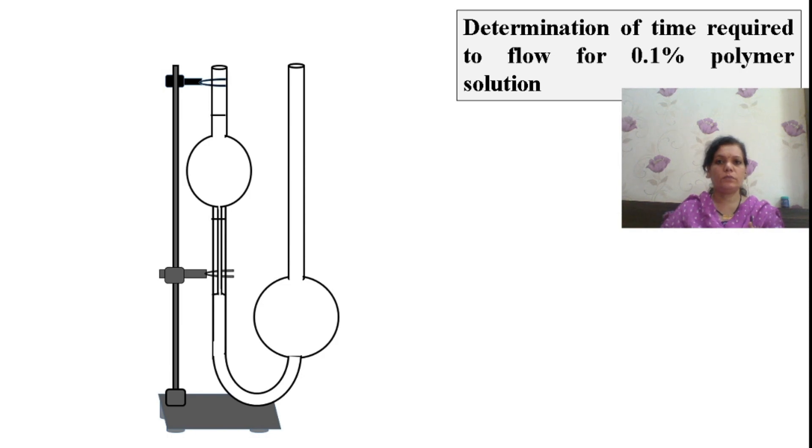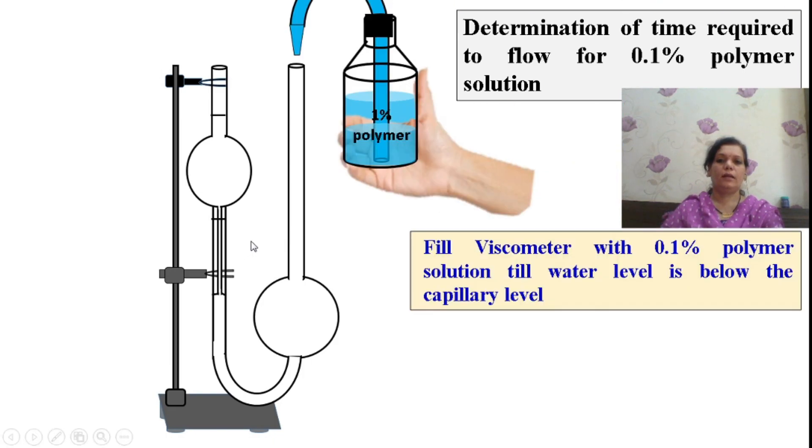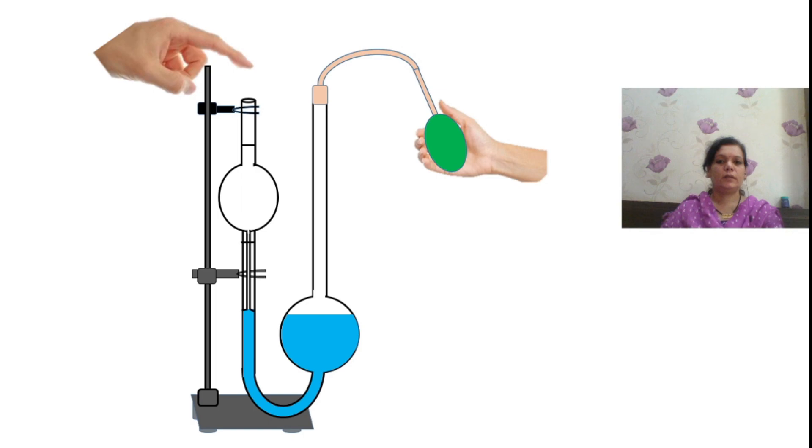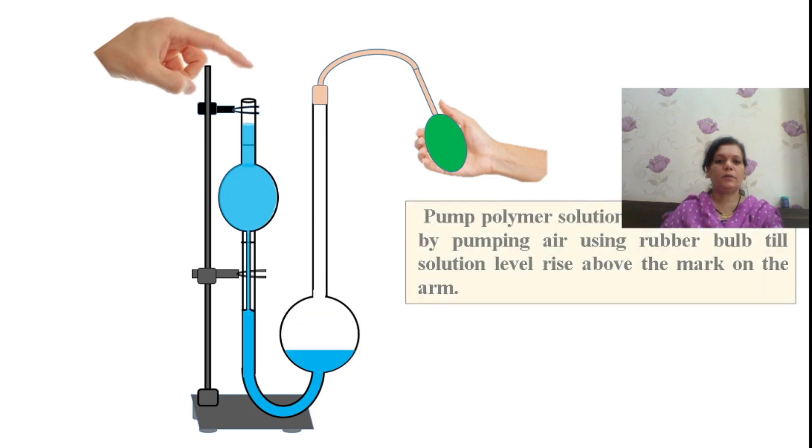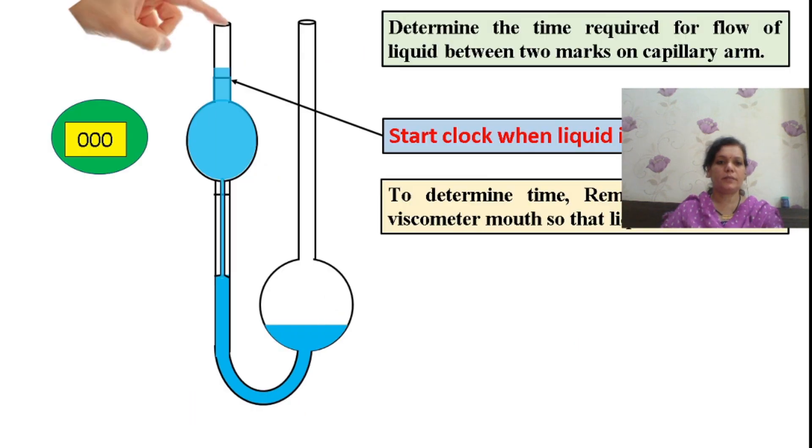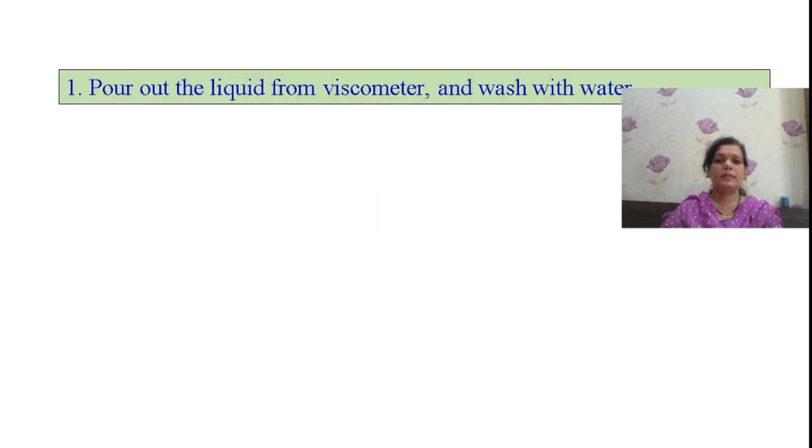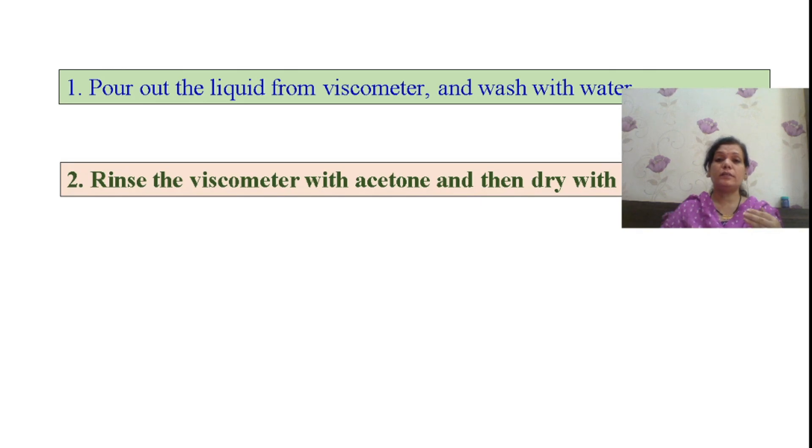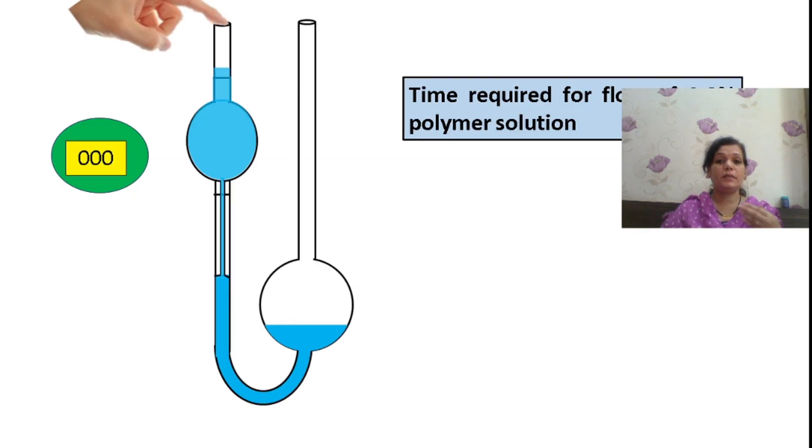Now, take your 0.1% solution. We will move from 0.1% to higher concentration. Fill it on this particular side. Look at the water level. Utilize the rubber bulb to pump air and measure the time of flow for 0.1% solution. It is 52. It is increasing. As you have utilized polymeric solution, it is increasing. As the density of the solution increases, the time of flow you will observe has been increased.